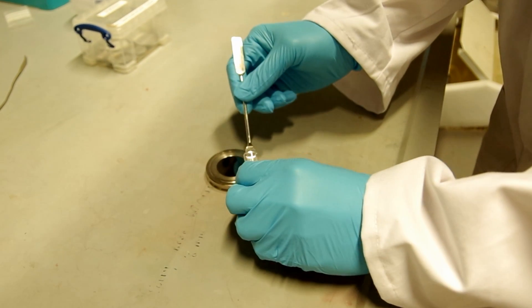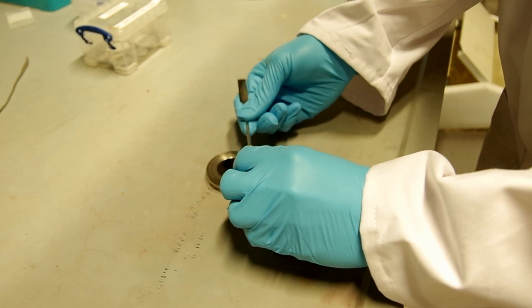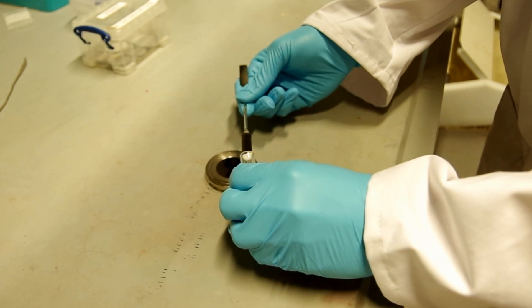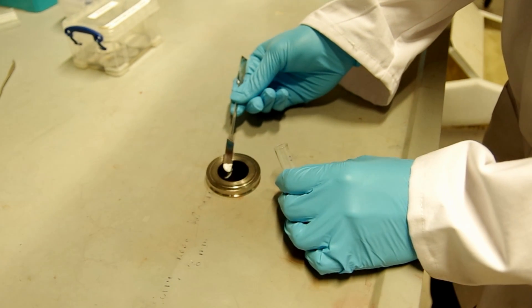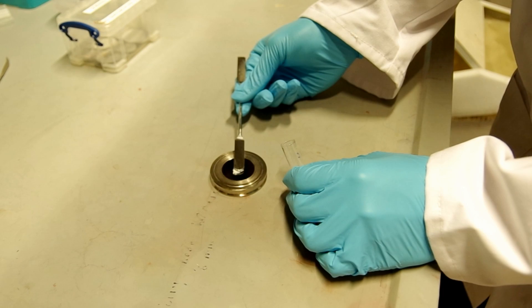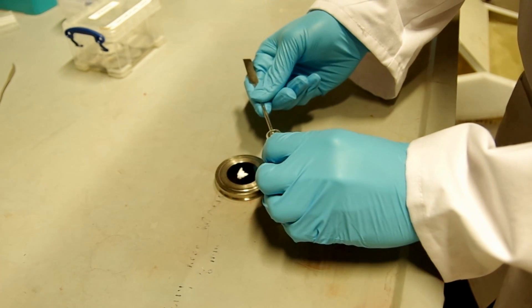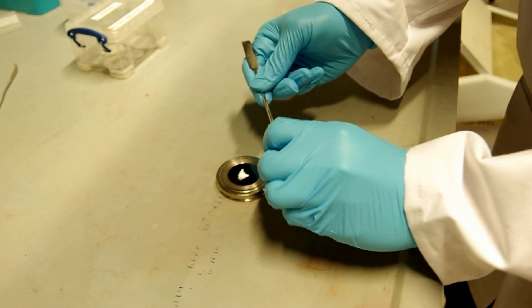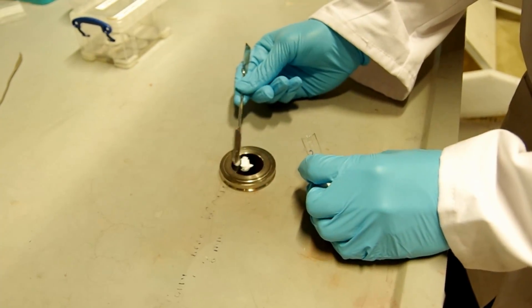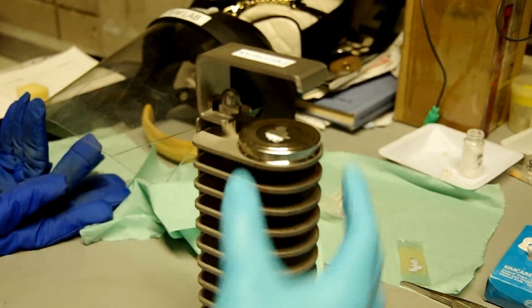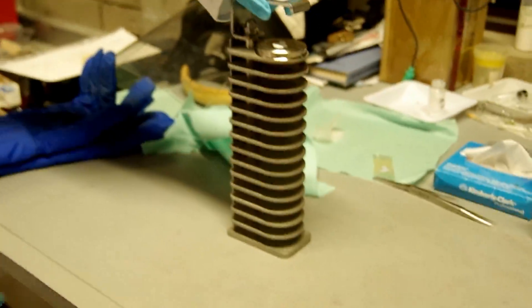Use the spatula to take up the sample powder and flatten it on the front of the silicon background. The sample specimen is then put on the sample holder.